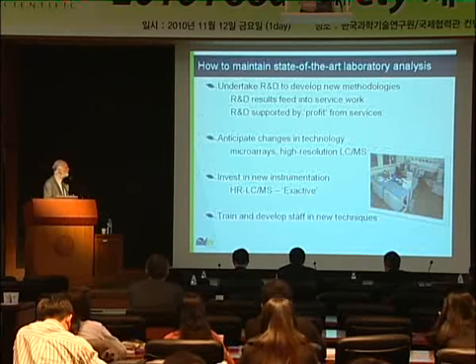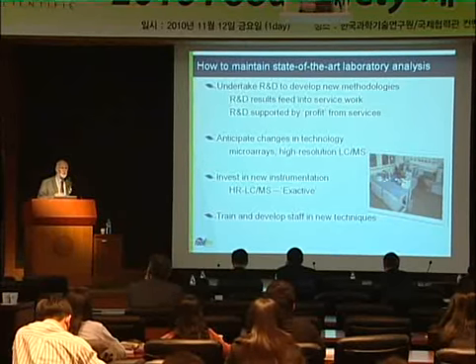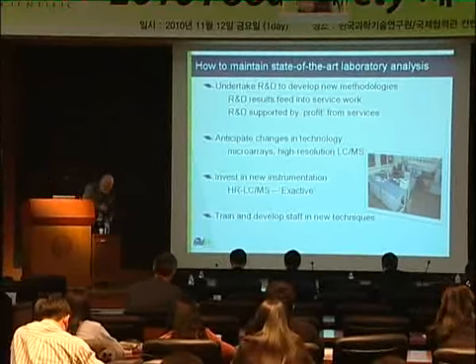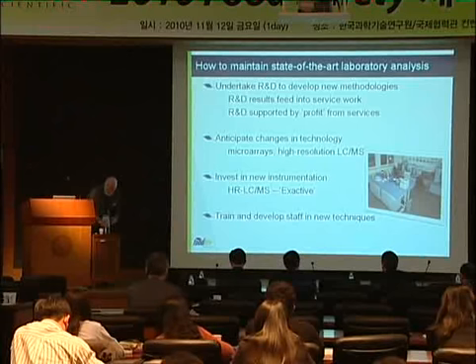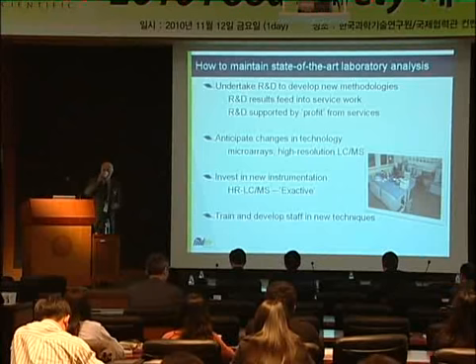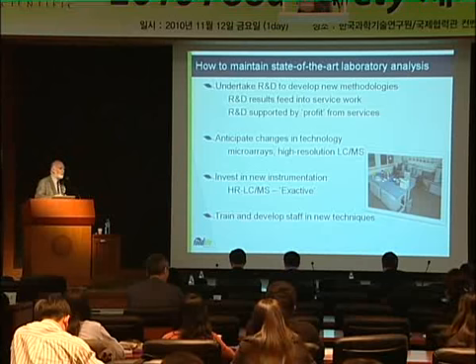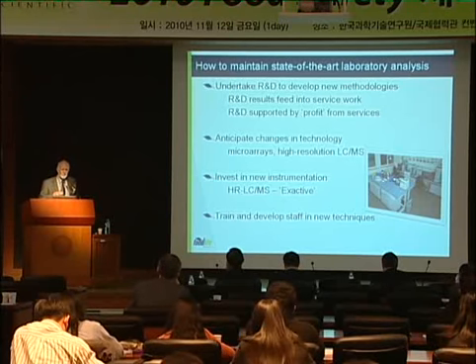Just coming back to the field, I've discussed a lot the cost elements of running a laboratory. I want to finish by talking about how you maintain the state-of-the-art laboratory. If you're running a laboratory, you can't use the same methods year after year, no matter how good these methods are.